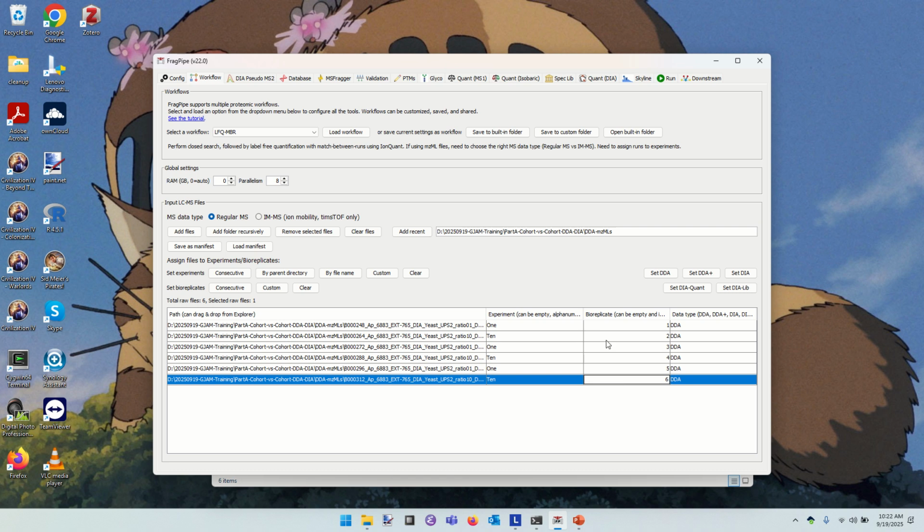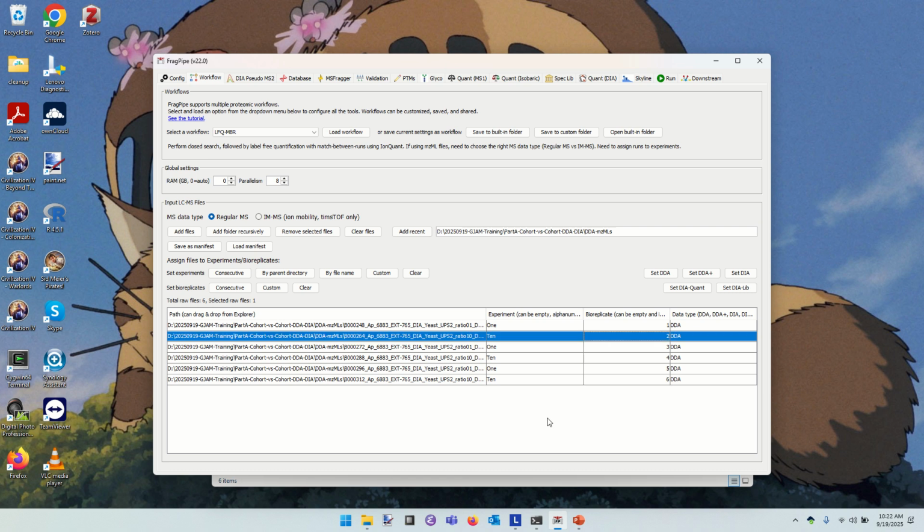So it's not particularly subtle what's going on there. I'm giving arbitrary names to these 6 files. If I wanted to make it easier to trace back to which file produced which identification, I would probably use something like these numbers because they change for each file, 248, 264, 272, and so on. I'm just not going to take the time to do that at the moment. It's helpful in that case to tell you which file corresponds to which replicate. All right. With that, we're done with this page. Does anyone need me to pause before moving ahead?